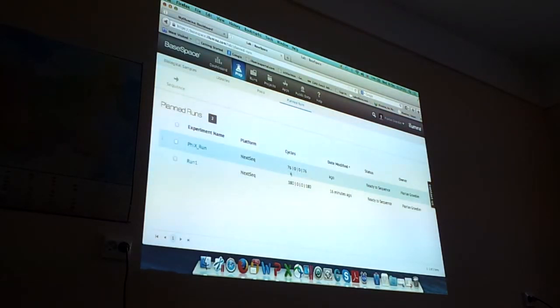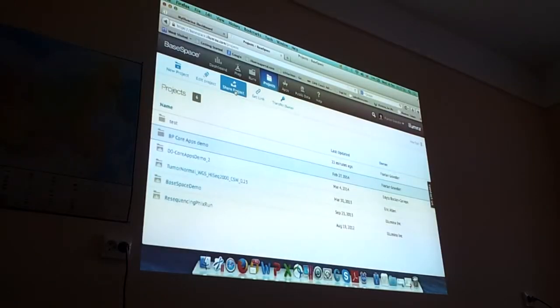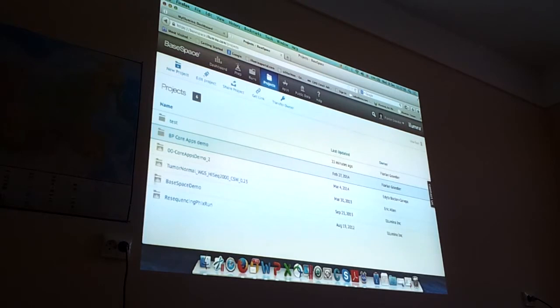So here we have what you uploaded, right? Maybe this is what I uploaded. Okay, and later we can see if I hopefully find it. I was just thinking, how can I share it? Because this I cannot share, and you can see here I'm only invited to view this project. But I'm not the owner, so I'm not allowed to share it with somebody else.